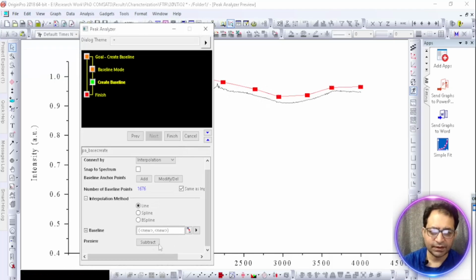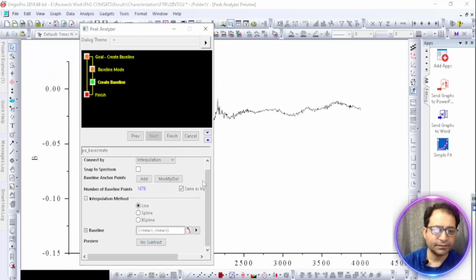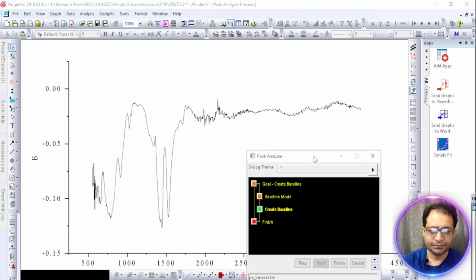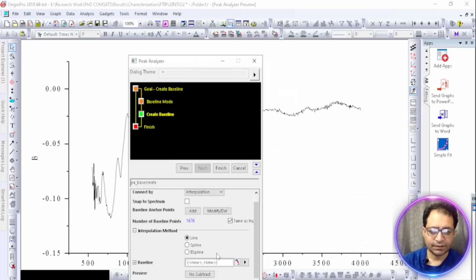Let's see if, yeah, I think it is okay. For me it is okay now. Okay, then I'll click on finish.